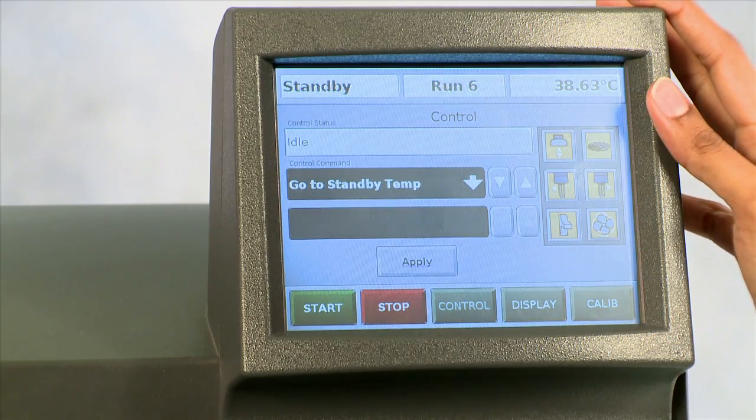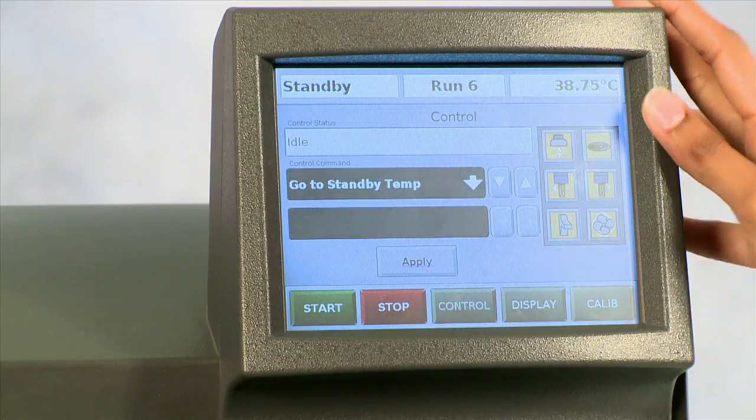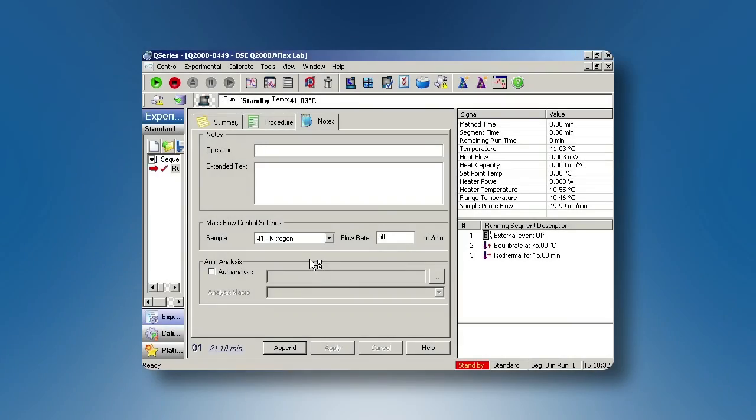Alternatively, you may be able to turn on the RCS from the instrument control software, which I will now demonstrate. Now we are in the Thermal Advantage instrument control software.